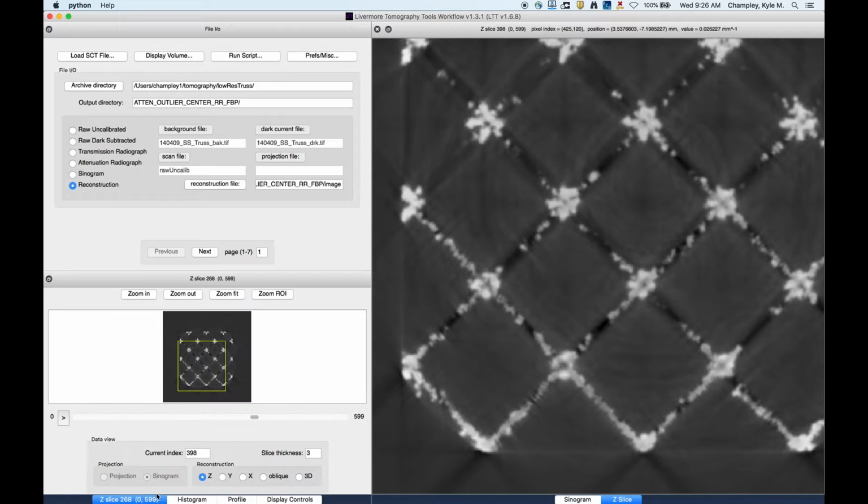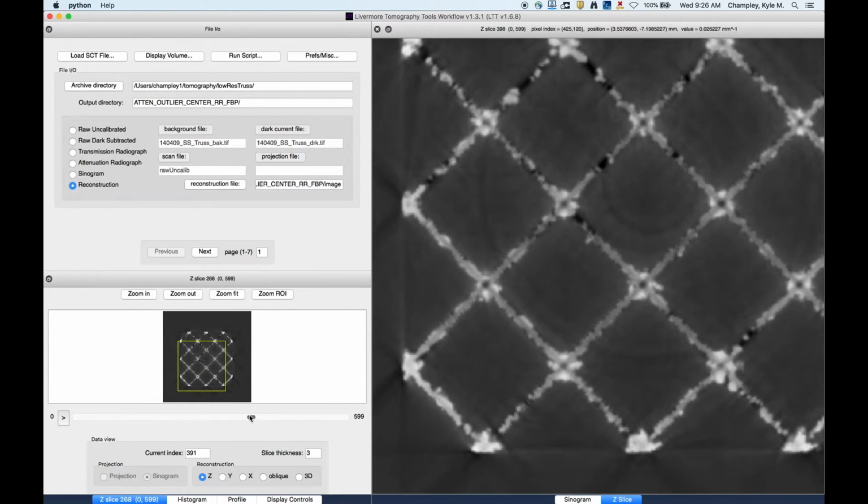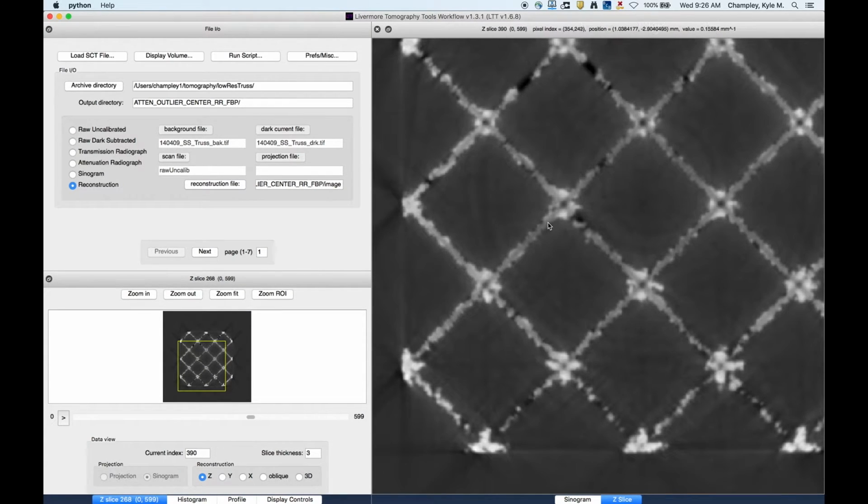So let's choose a little bit different slice, one where we see an apparent hole. So I'm going to drag, let's say I want to know the length of this. I can click and drag, and it says that it's 3.1 millimeters, and the line's at 135.17 degrees.